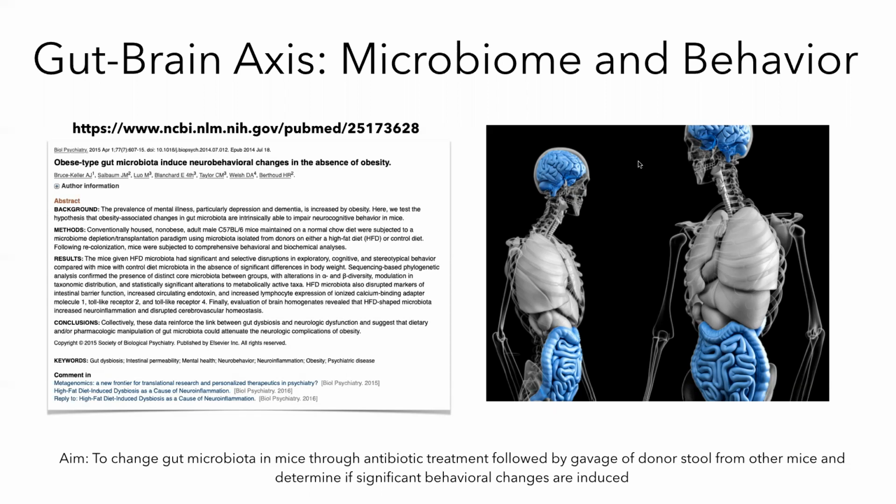So we know how functionally some of the taxa work, and so we can also look at that. So I think what is going to be interesting is for us to look at this project. We're going to look at just a small subset to understand how the pipeline works. But then you're, of course, welcome to take the full data set and play around with it and see what's in it. And so I'll walk through some of the preparation of data and then how to run the pipeline.